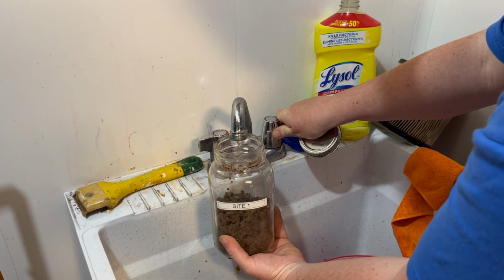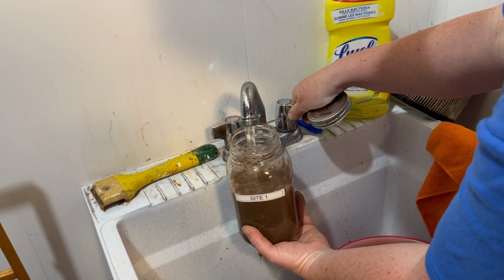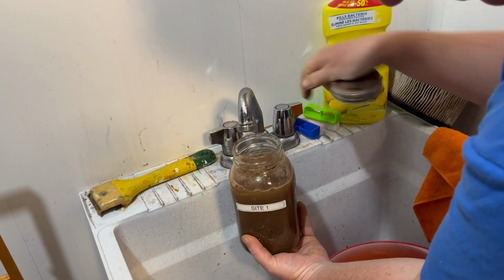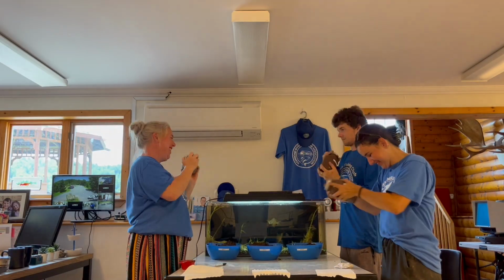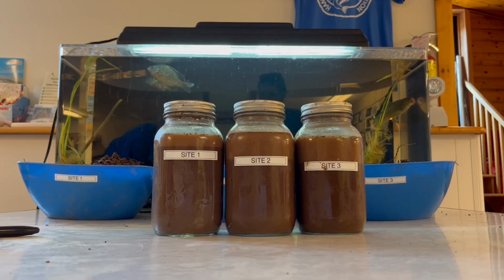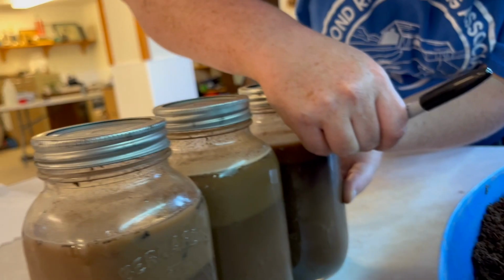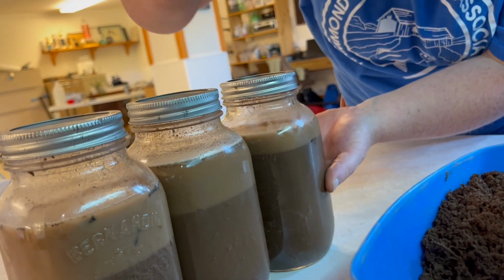Once the jar is filled with soil, fill the rest with water, leaving a 1-inch gap at the top for room for mixing. Now shake for 3 minutes so that all the soil is broken up into smaller particles. Allow it to sit for 1 minute. Since sand is heaviest, it will settle the fastest. Mark the top of the sand layer with a permanent marker.